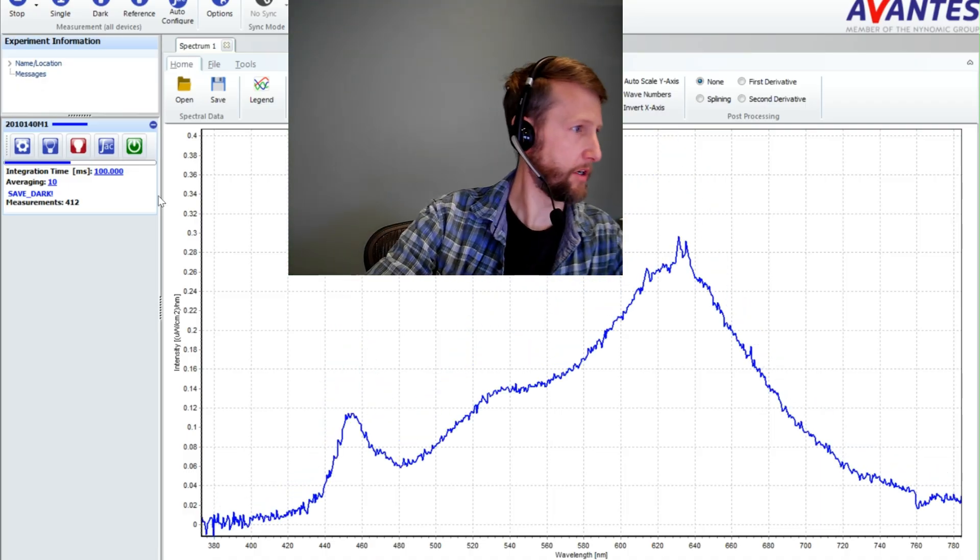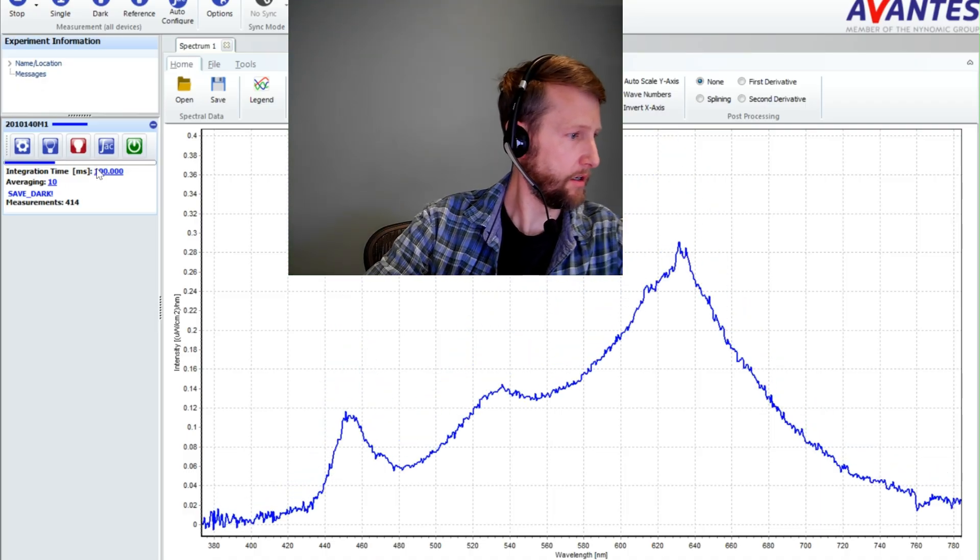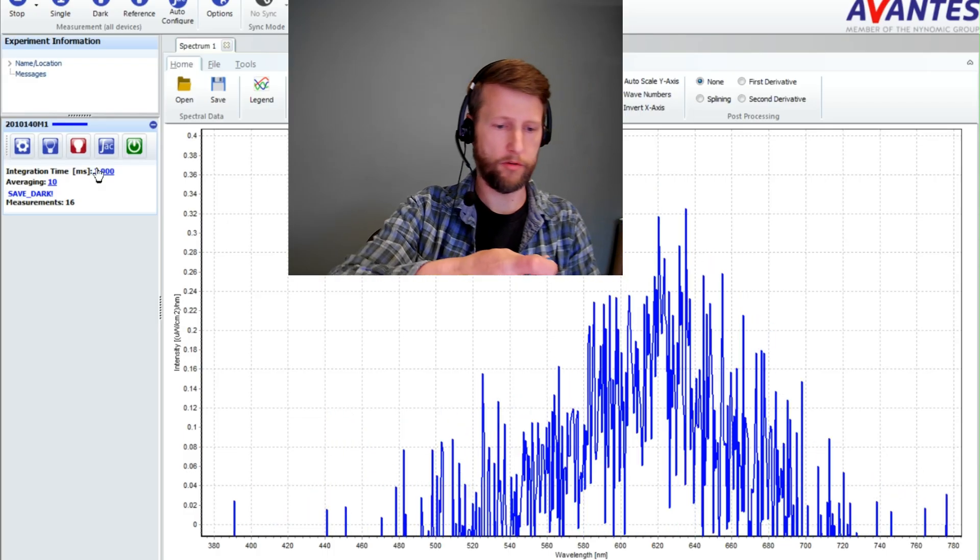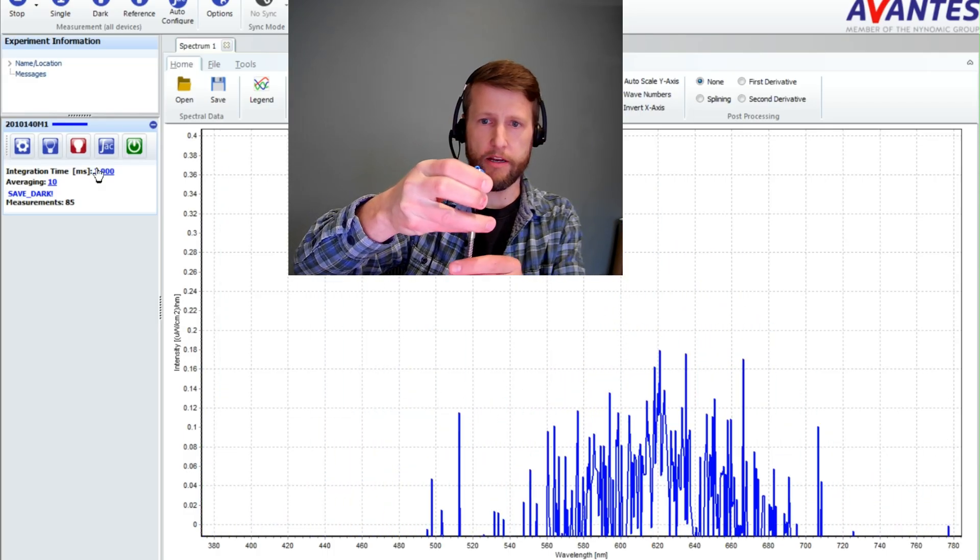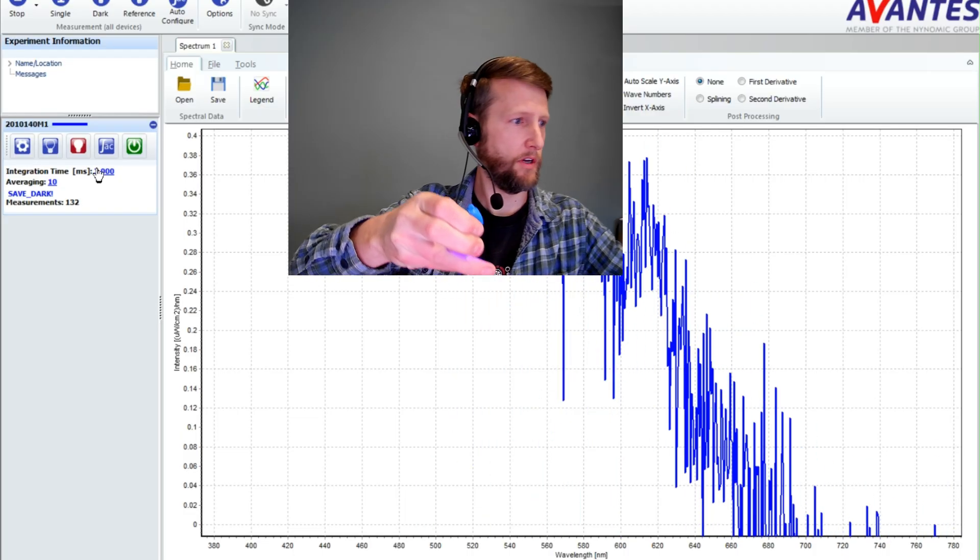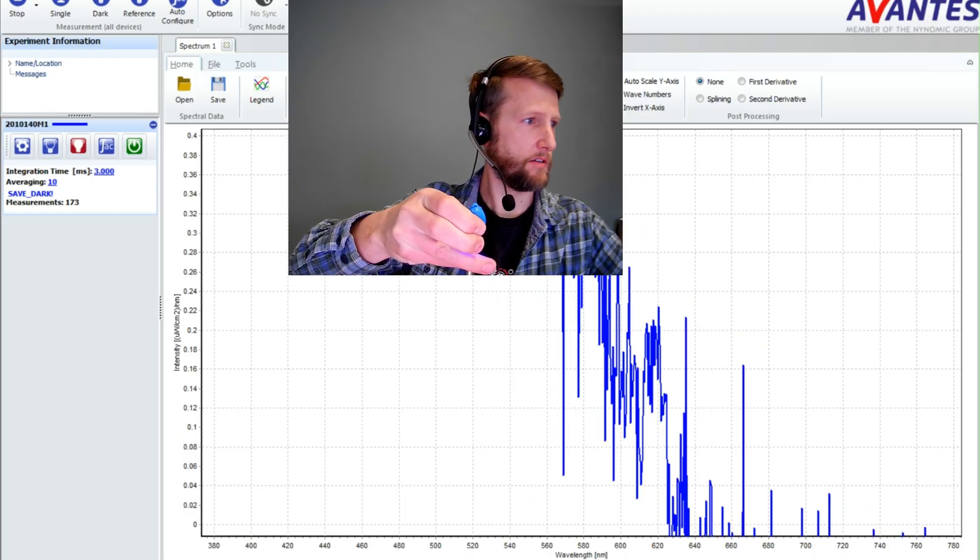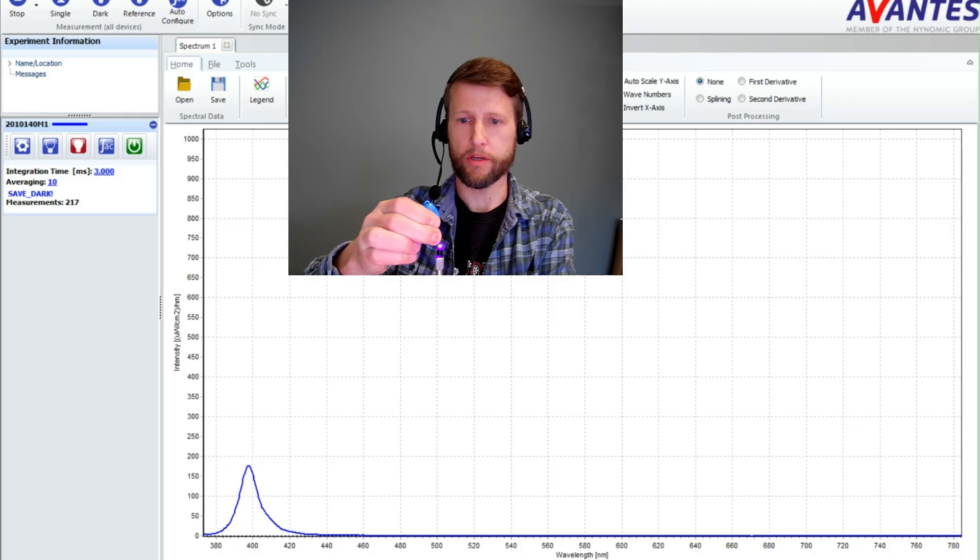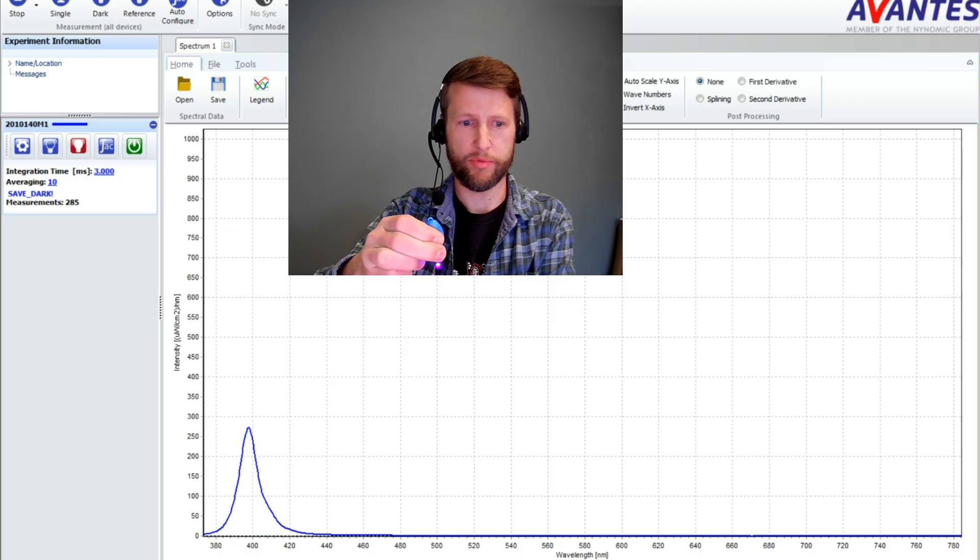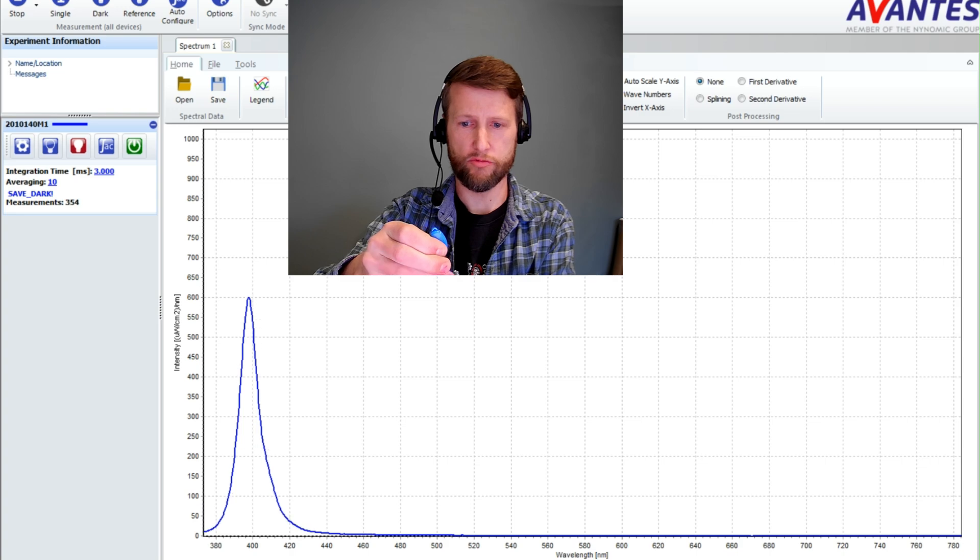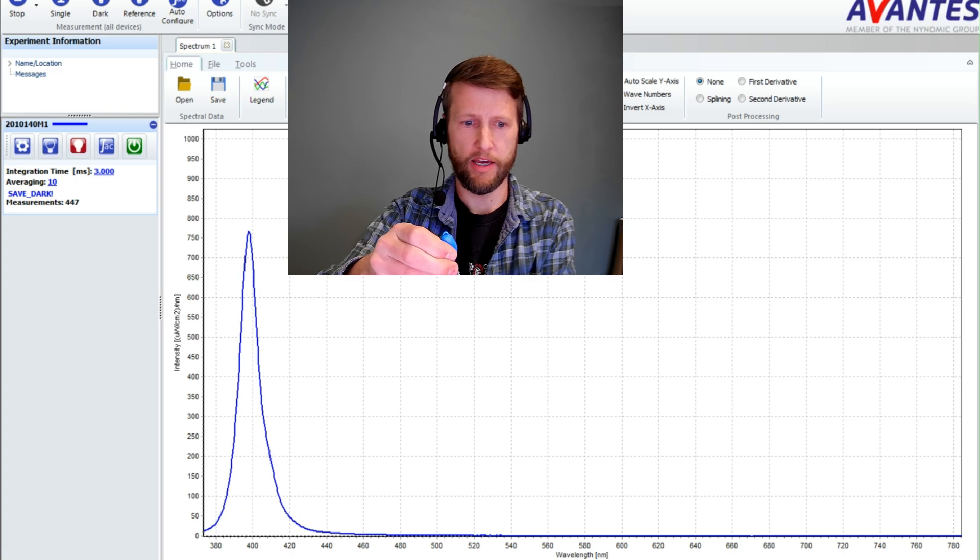And I'm going to change some settings here real quick so that I don't overload my spectrometer. And I can take the LED and shine it right into the end of this spectrometer and we can look at exactly where that peak is. So that peak from this LED is right around 400 nanometers, actually just a little below 400 nanometers.